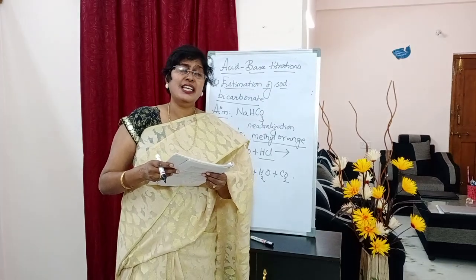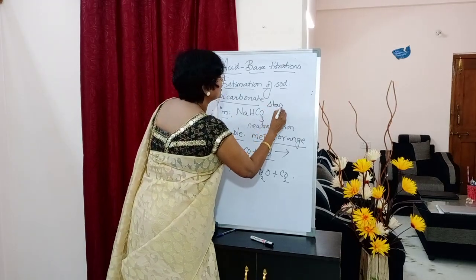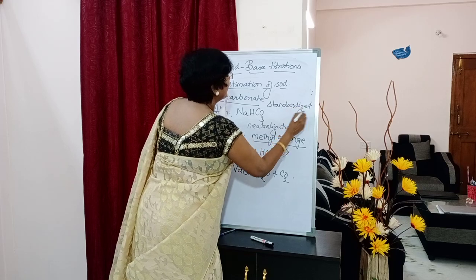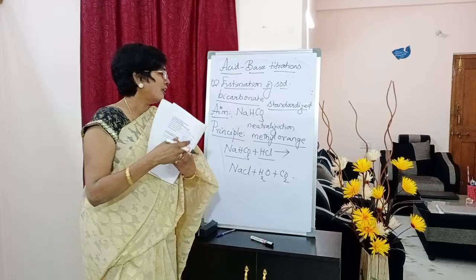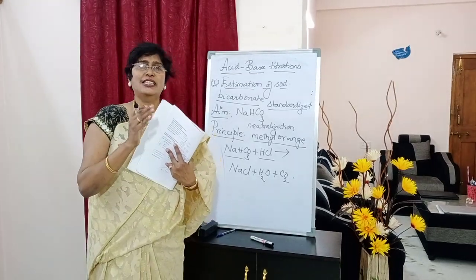Below write down: HCl can be standardized. I will be telling you about all these, what standardization is, what an indicator is, don't worry.